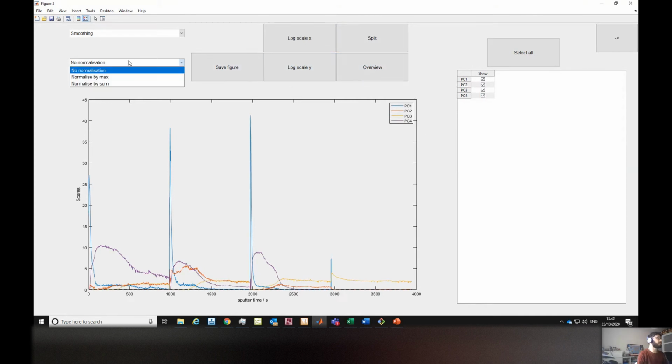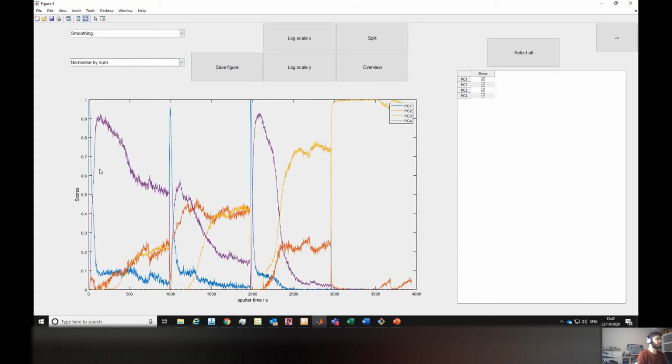Okay, so we'll do some renormalization just to help on the visualization, so it adds up to 100% at each level. And you can see first yellow is clearly the substrate signal, something that the worm was on top of, right? Because it starts very intense and it stays very intense for the ROI on the substrate. So this helps us to imagine, because here we've gone through the entire sample. So we can see the yellow coming up after we etched everything.